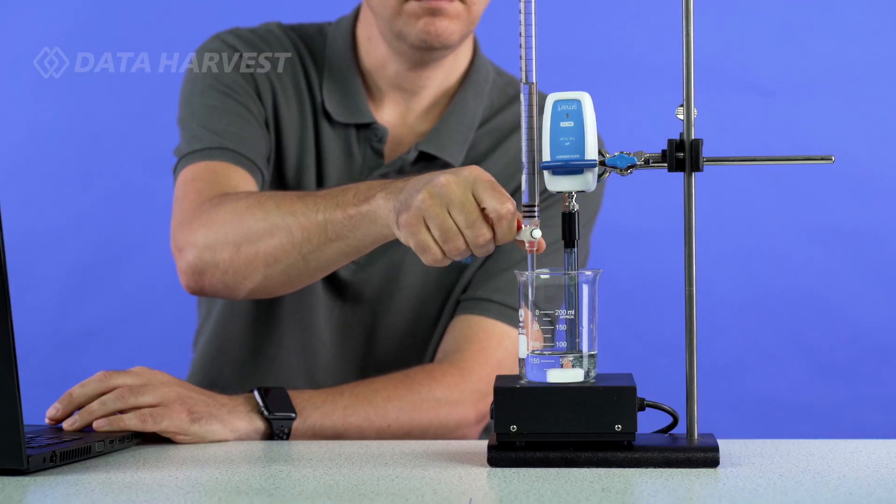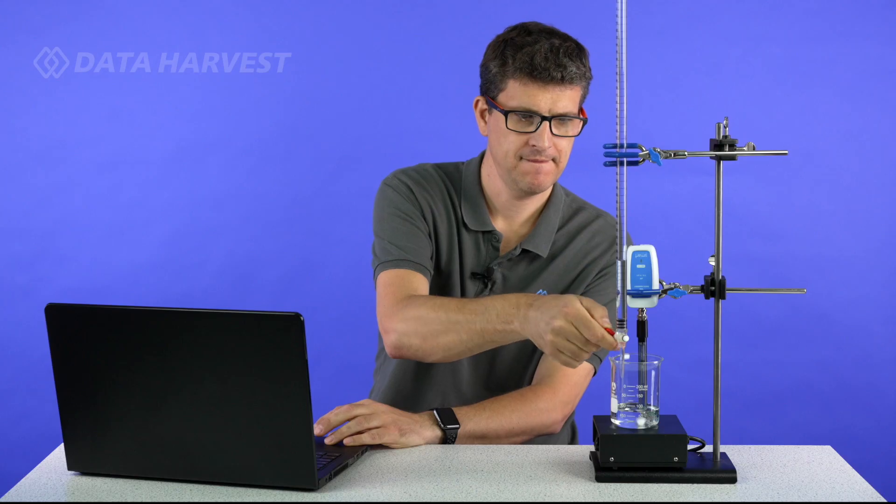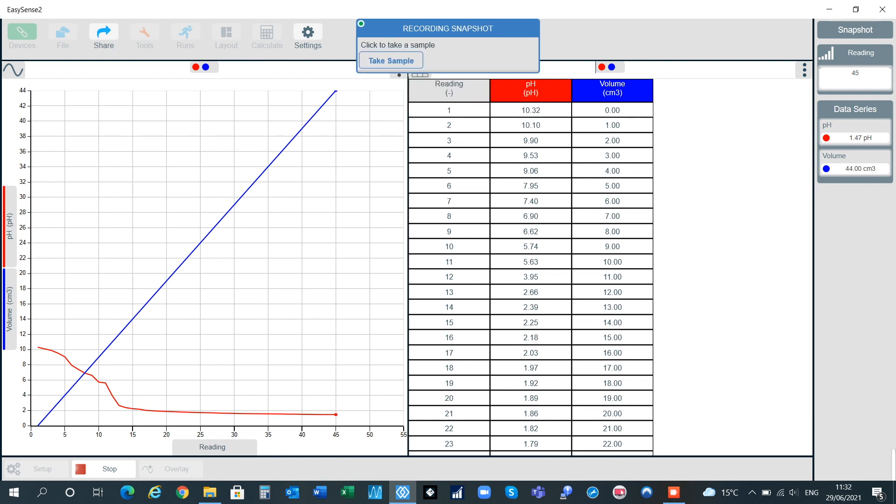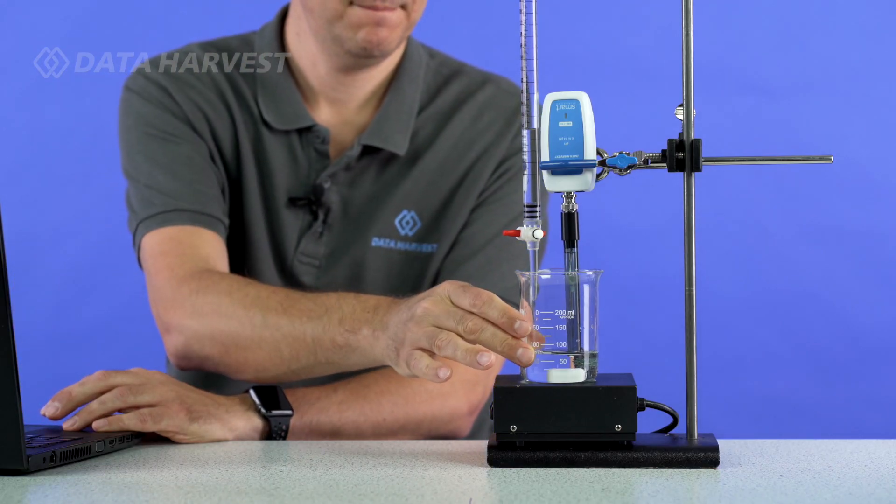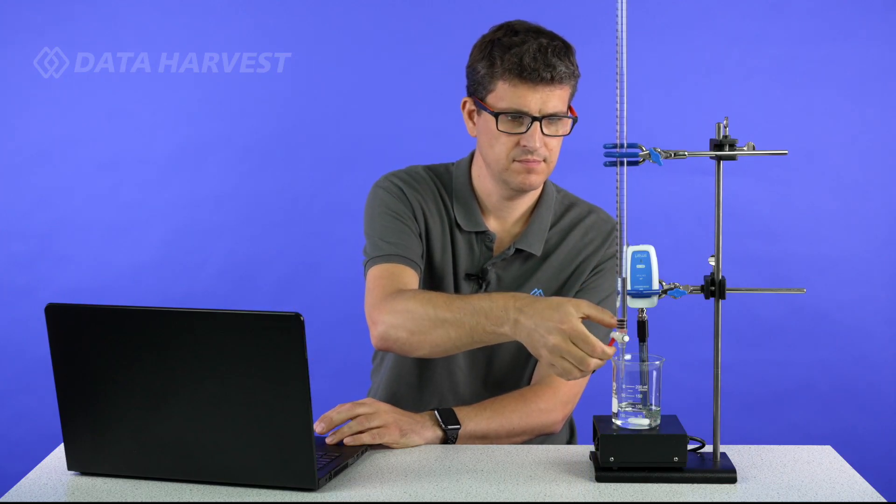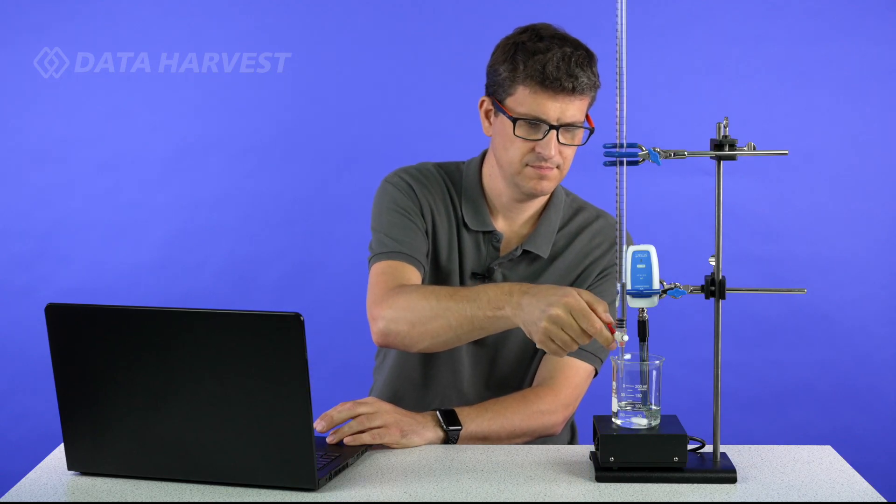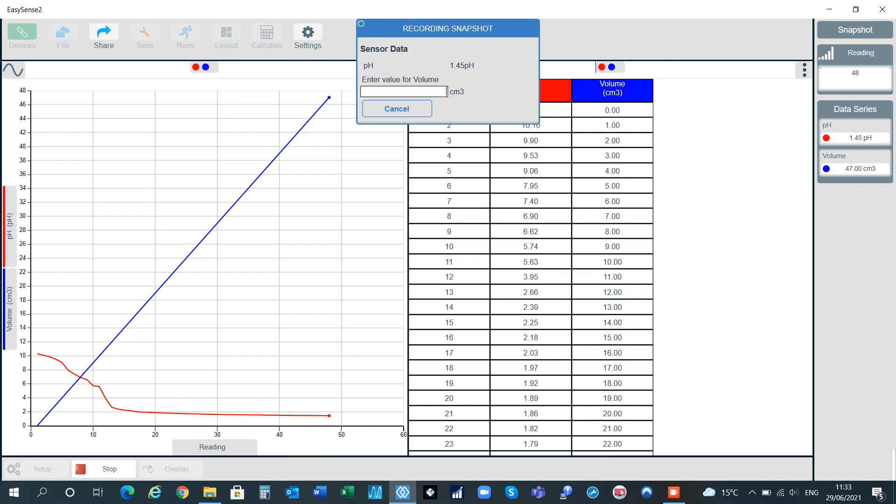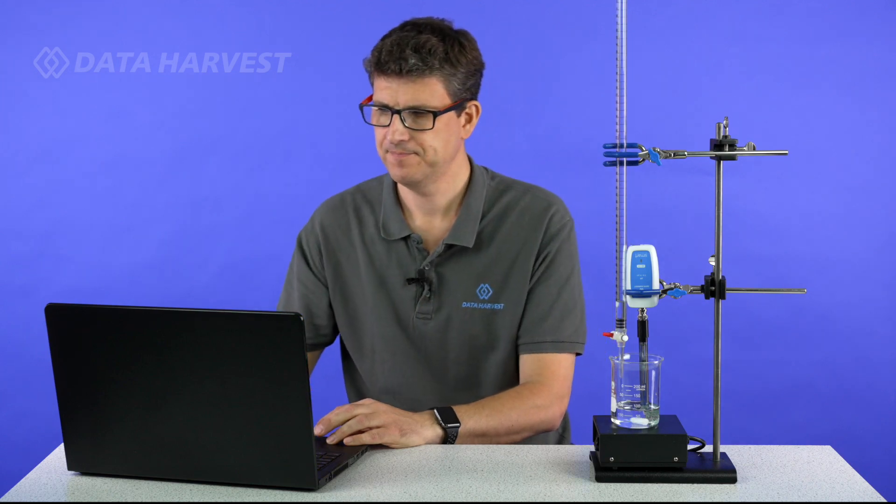42. 43. 44. 45. 46. 47. 48. 49. One more to go. There you go. So we now go to 50.